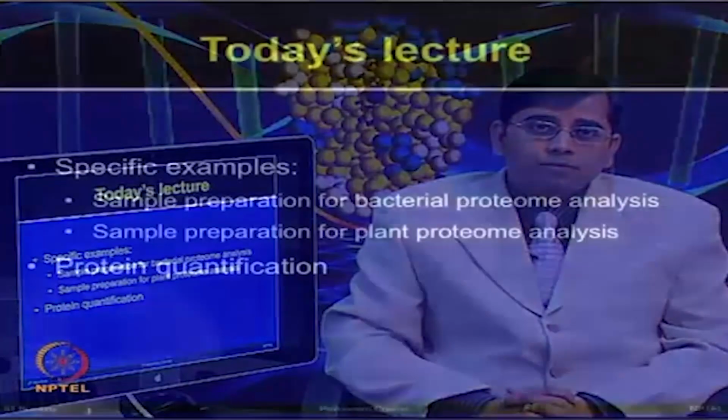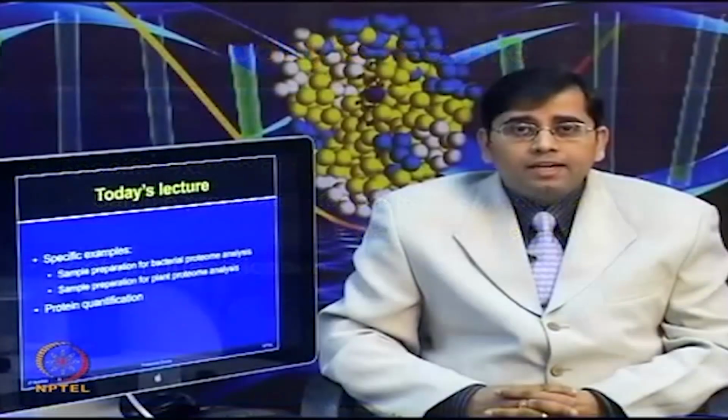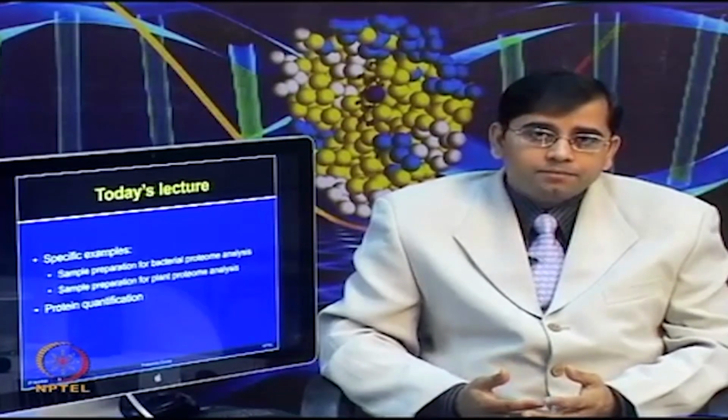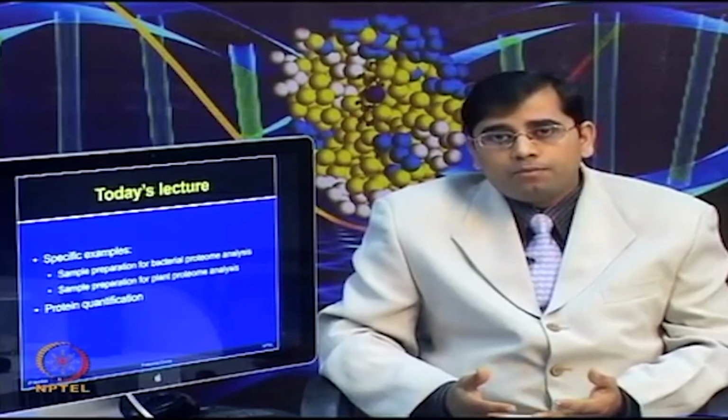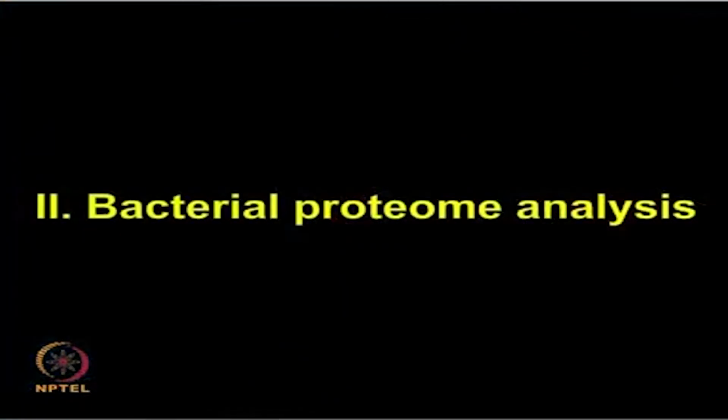So, in today's lecture, we will first talk about different types of methods available for bacterial protein extraction. I will recommend one method and elaborate on that. Then we will talk about how to prepare good samples for plant proteome analysis. We will then talk about how to quantify the proteins accurately, so that you are ready to perform proteome experiments. Okay, so, let us start with the bacterial proteome analysis.